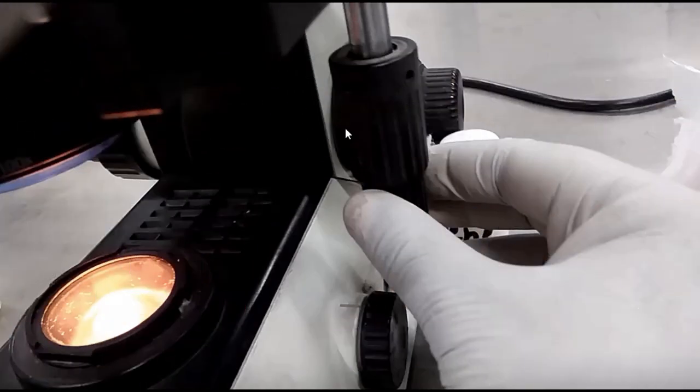Now about the parts of the compound microscope. It is mainly divided into three subheadings. One is the microscope stand, another is the stage, and the other is the microscope optics. So let's know about the microscope stand.